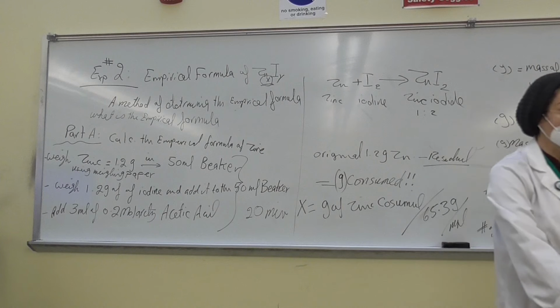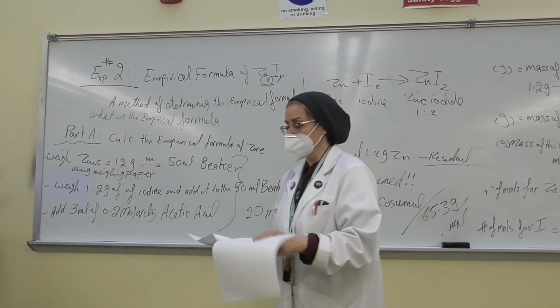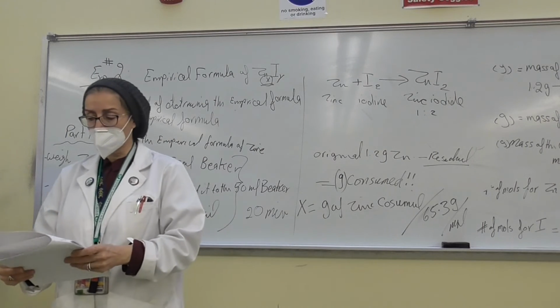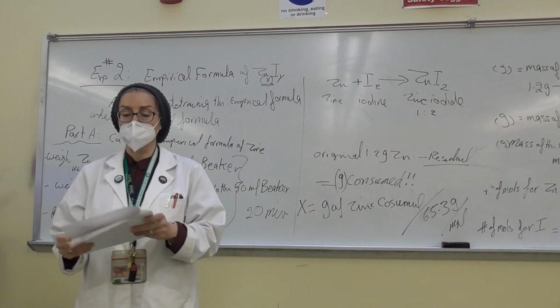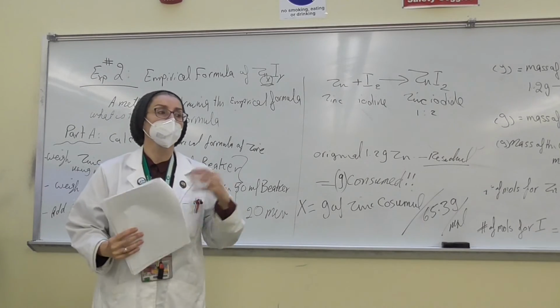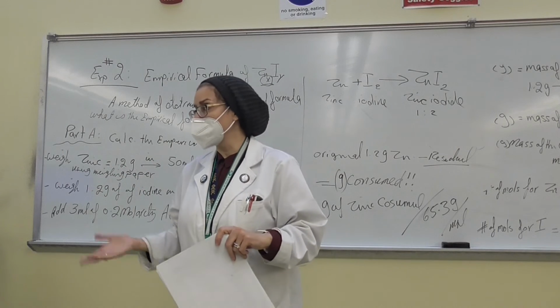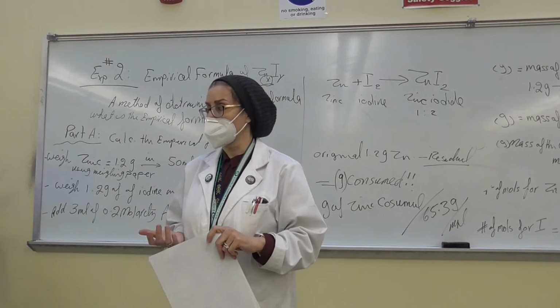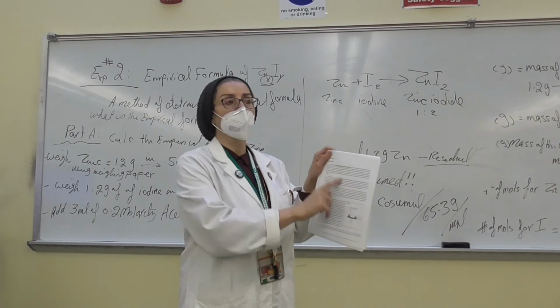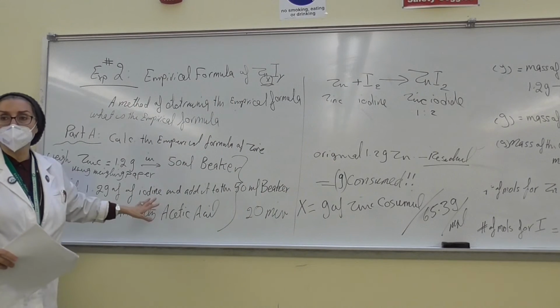Now, where are we going to find whatever I talked about? Okay, so you go into page number 17, the procedure for part A. Follow the procedure. Whatever I was talking to you about, if you did not read it, you're not going to recall what I just said, right? So please read that. It's actually giving you exactly step by step. I put it in here for you.